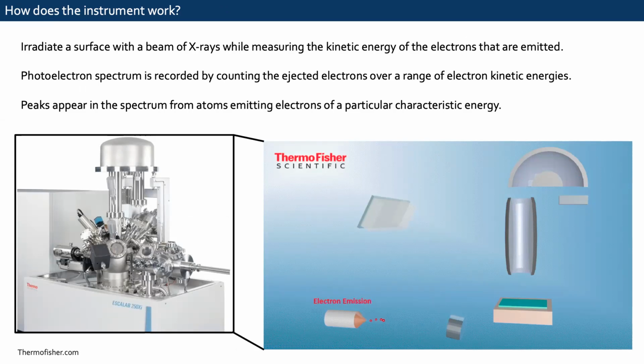And then you are going to basically get really fuzzy results because there are going to be different collision processes that are going to change the energies of the emitted electrons. And then you basically have no idea what your system really is. It's not just the energies, it's also the number of electrons. And this is the same principle why in SEM or TEM, you also need high vacuum environments.